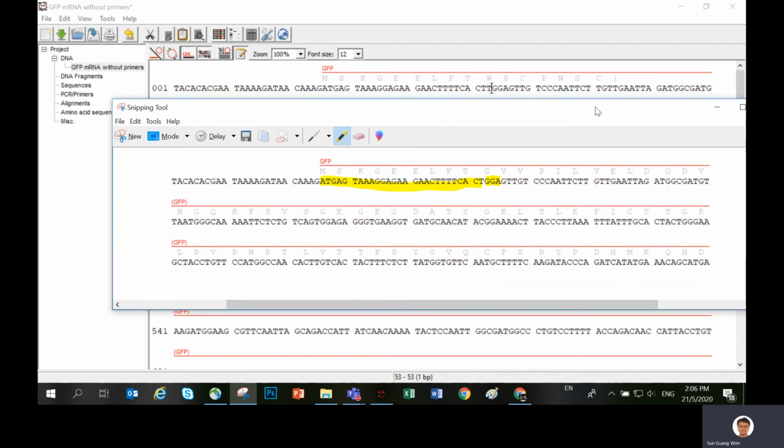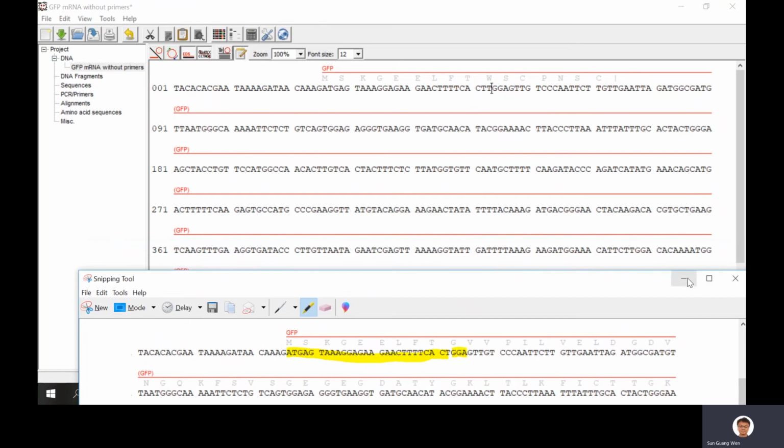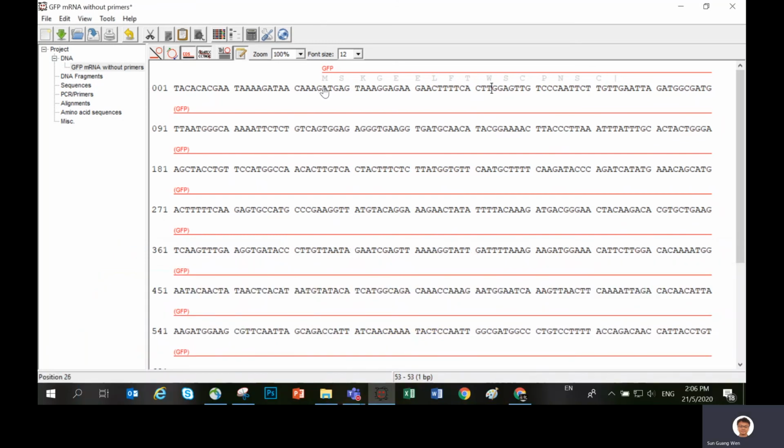Here a new stop codon will be created. So you can see this entire mRNA will be translated only up to this earlier short part, becoming a truncated polypeptide. Even if this peptide is made, it will be quickly degraded. It will not be functional.